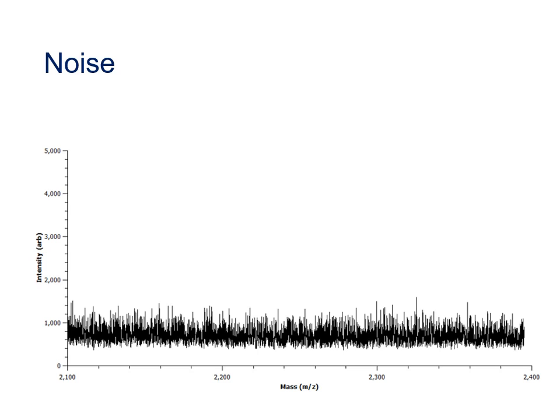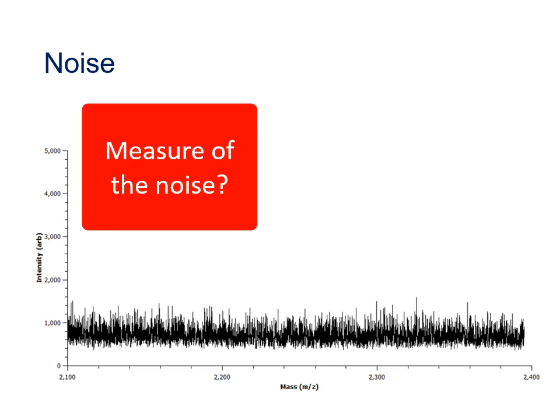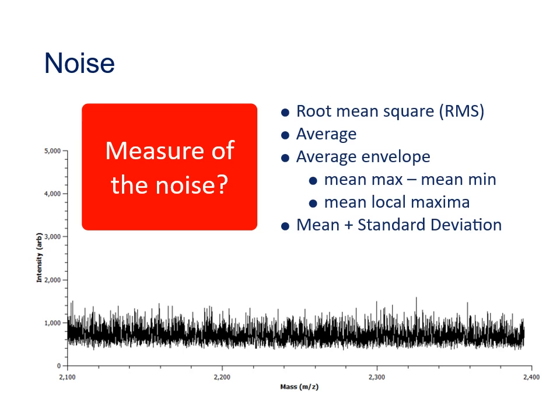So we've discussed what noise is, and the importance of measuring spectral quality using the signal-to-noise ratio, and how averaging can improve this. But if we want to actually be able to calculate a real signal-to-noise ratio, we need to have some way to measure the noise level. In fact, this is such a fundamental concept, you'd be forgiven for thinking that there must be some specific way to do this. But surprisingly, there isn't. If you review the literature, there is a wide variety of different measures of the noise intensity that are chosen. And here's a list of some of the more common ones.